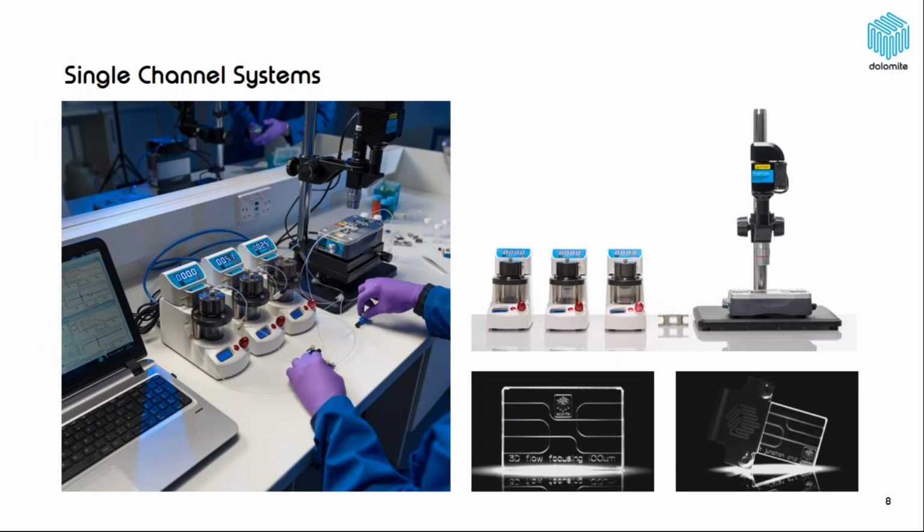Now, the systems come in two flavors or two throughputs. So there's an R&D system, like we will be demonstrating after this presentation, and that's based on a single junction. In that single junction, you'll typically have a T-piece where two liquids meet at the interface, thus creating droplets or particles. You typically have 3 pressure pumps, and you typically have a microscope to image the chip.